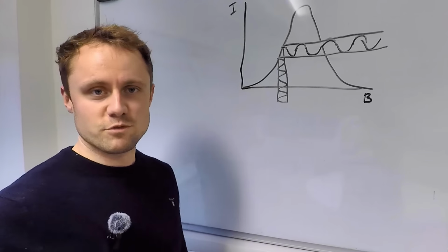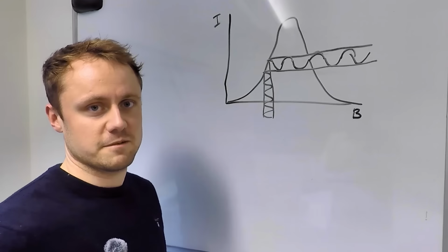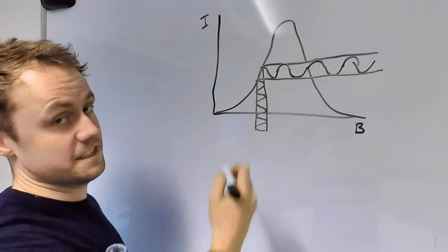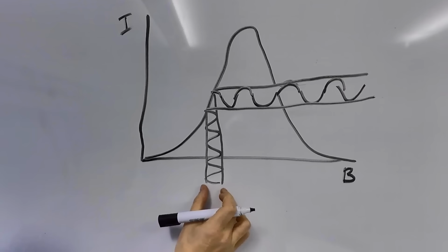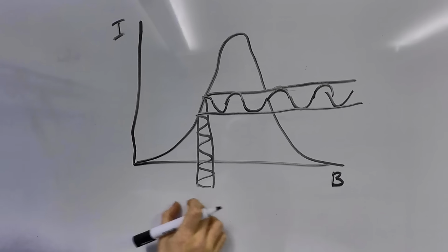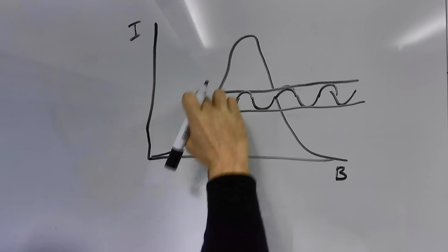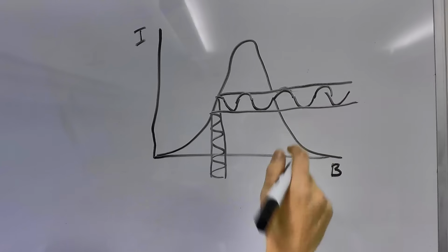Now, the end result of this is that actually we're not measuring this peak shape directly. Instead, what we're measuring is the gradient. If you imagine, as this oscillating section here moves across this graph as the center point of it is varied, the slope of the peak changes and therefore the amplitude of this oscillation changes.